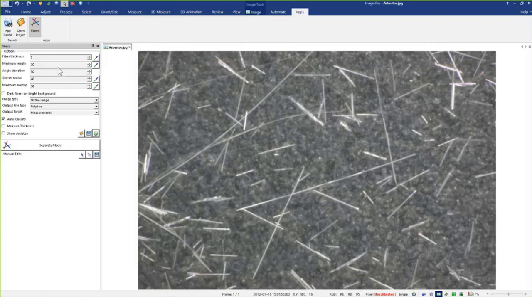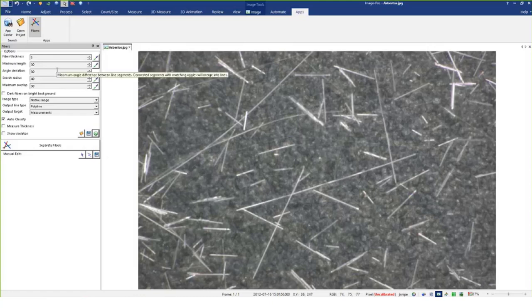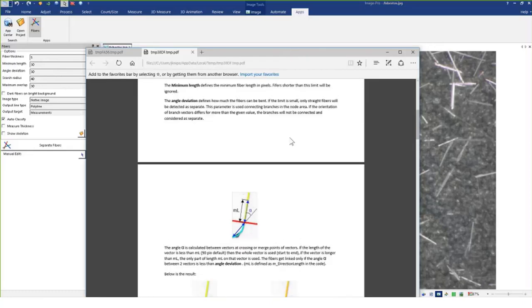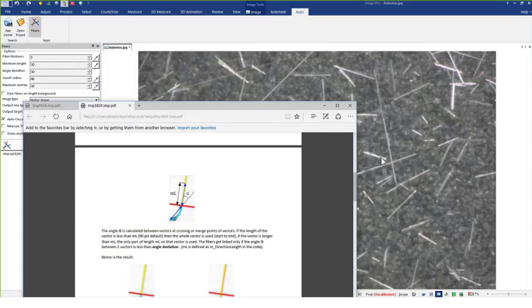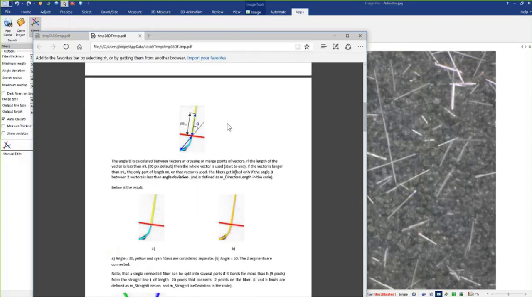Minimum fiber length — as you can see there are some long fibers and short fibers. You can simply click on the button and draw along the fiber and that will give you a minimum fiber length, so there are constraints about determining what is a fiber and what is not. Angle of deviation — as I mentioned, we can measure fibers that are curving. If it deviates more than a set number of degrees, it will break that fiber into two. So if you have something that actually does curve around a bit, you can set it to a larger angle and measure it as a single fiber.